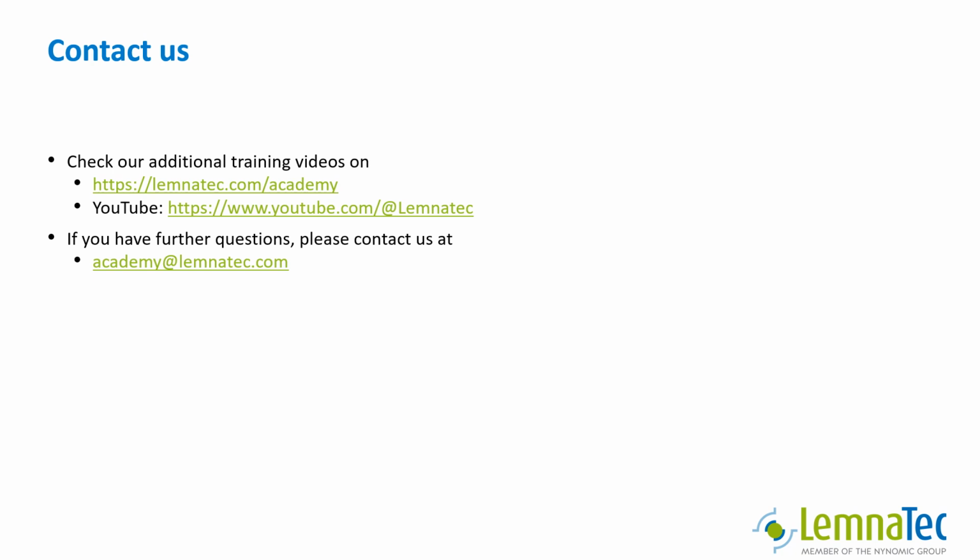So differences will occur in the software interface, and we will explain them in the corresponding training. For some types of phenotyping systems, introductory videos on how to use the hardware in combination with LemnaControl are given in our YouTube channel.